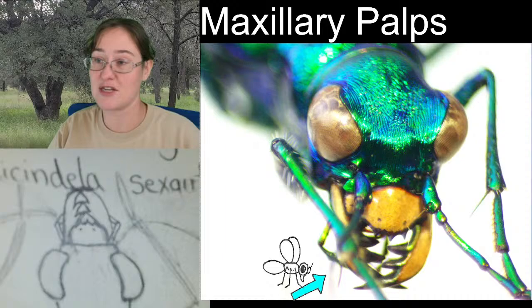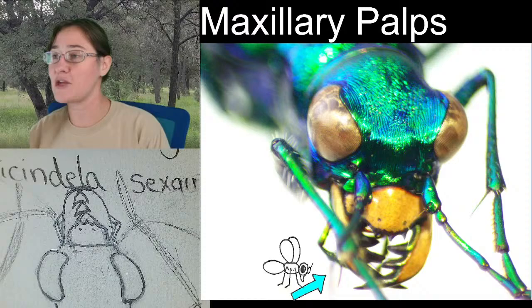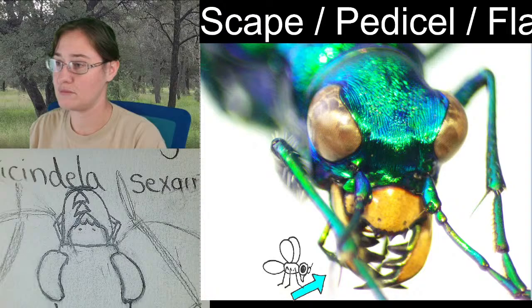All right, so we've got our mandibles, the labrum, the maxillary palps. We're going to be looking a little bit at these antennae, at least where the antennae connect into the head. You have the scape, the pedicel, and then the flagellum. And these are your three words for our antenna.